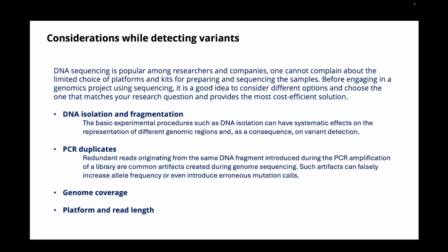So removing PCR duplicates is a good idea to do before variant calling, because variant calling is based on the evidence of the number of reads supporting that particular variant. So if you're supplementing your data with repeats of the same read that are supporting the same variant, it would not be a good case. So during PCR duplication removal, what they check is basically reads having the same start and end position, aligning to the same position, with the same length of read, and you have a number of reads of that kind. So those are most likely PCR duplicates. Right?